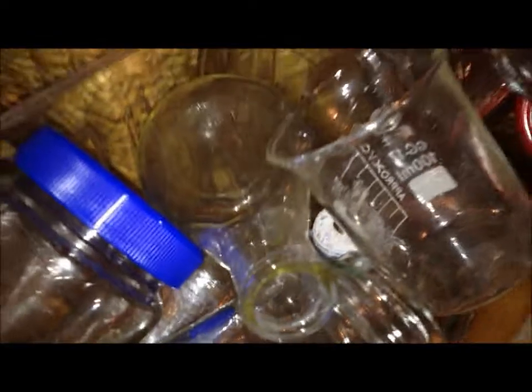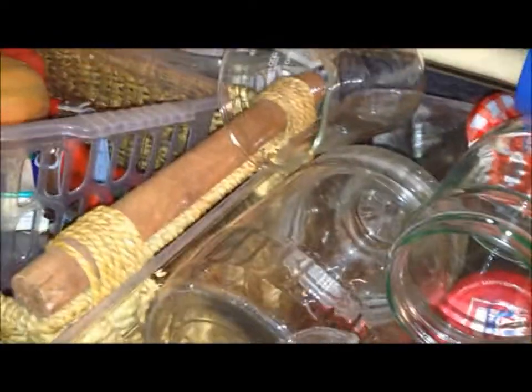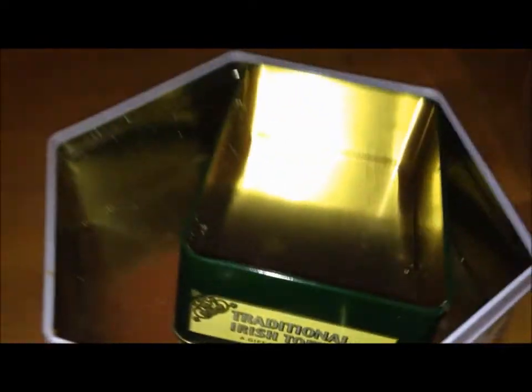Here is all my glassware: a 100ml beaker, a 250ml beaker, a 100ml conical flask, and lots of jam jars which I use as well, including this big one which I'm going to use to make nitric acid. Filter papers, and some tins which I use to carry chemicals outside.